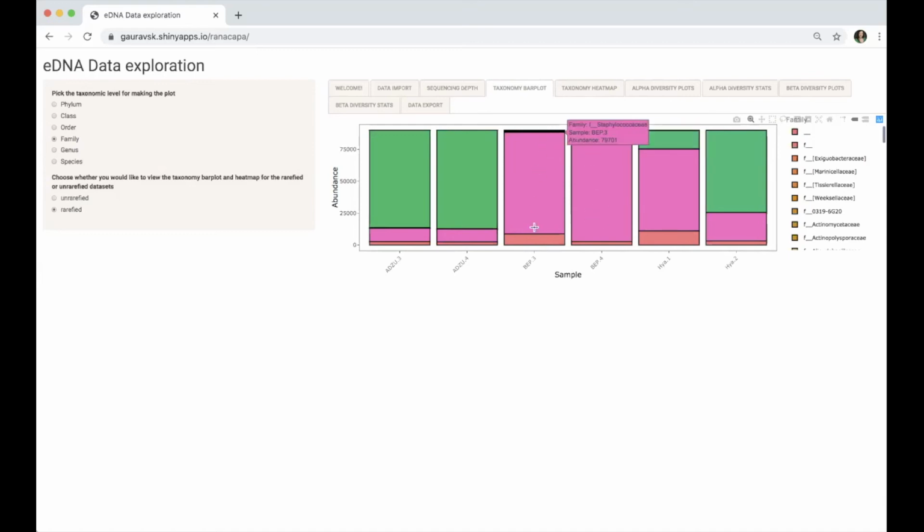If we look at hyacinth, which had our highest Shannon diversity, we see that it is also highly dominated by one type of bacteria, but we also see a lot of this second bacterial type, this Enterococcaceae, and we see a lot more of this orange unknown representation. So even though it is still fairly dominated by one organism, it's not as highly dominated as this one, and there's a little more room for different organisms. These green bars, there's a little bit more of them, and there's a little bit more of this orange.